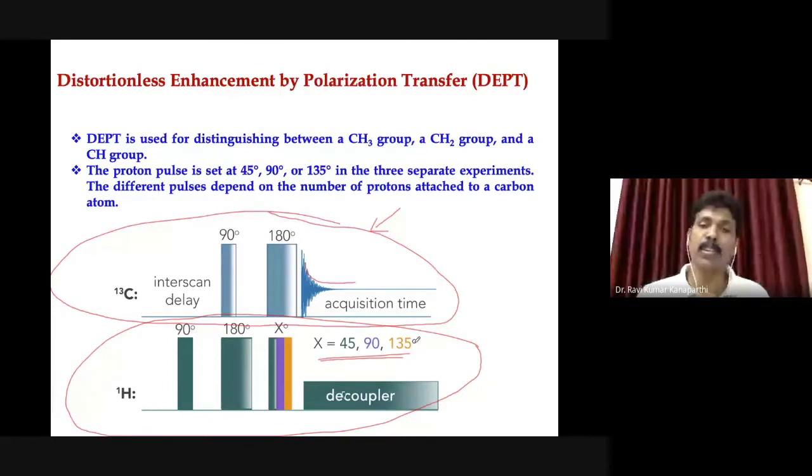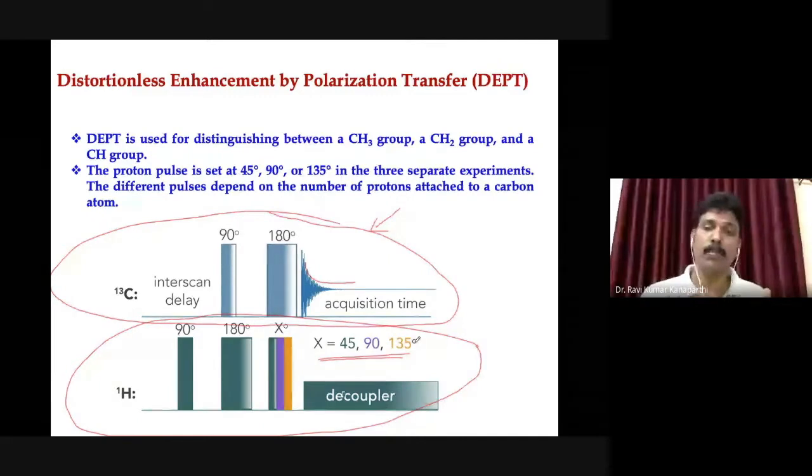Please remember that at the beginning of the NMR lectures, I gave a couple of points about what a 90-degree pulse is. In the older days, the technique was basically scanning one by one, either a field sweep or a frequency sweep method. Keeping the magnetic field constant, we vary the frequency of the resonating RF pulse, so the nuclei come under resonance.